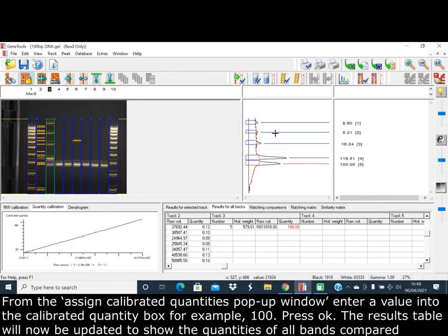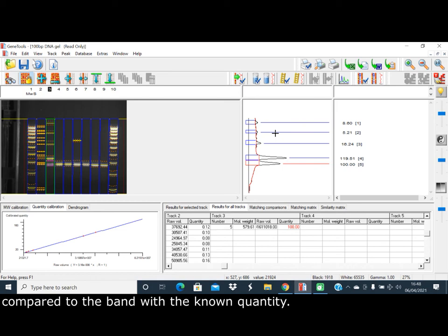The results table will now be updated to show the quantities of all bands compared to the band with the known quantity.